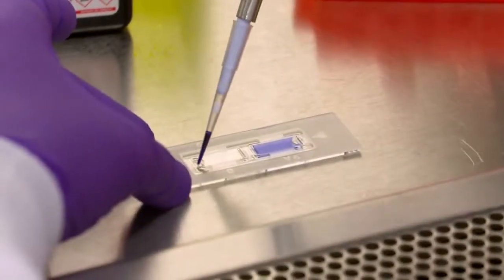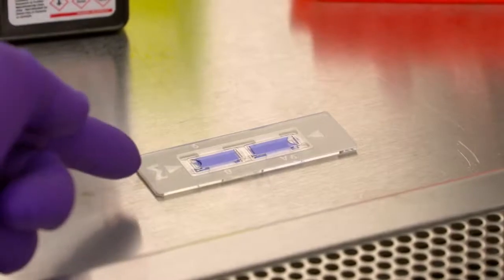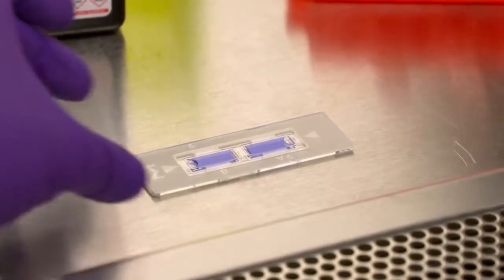In case of high-precision disposable hemocytometers, the chamber itself is already assembled with the ceiling on top to produce 0.1 millimeter sample depth.